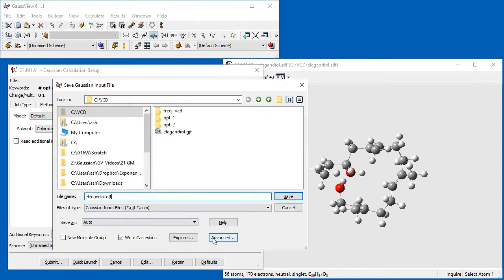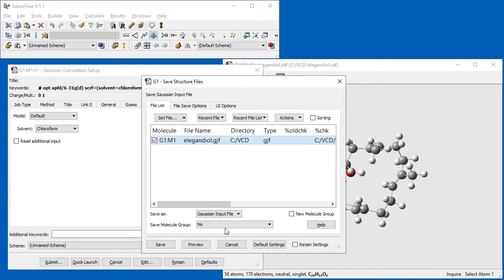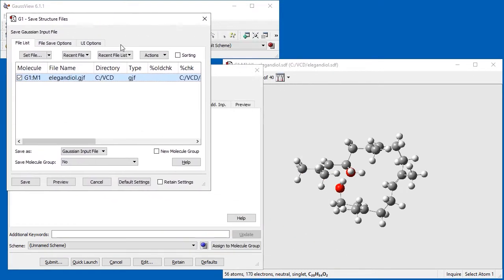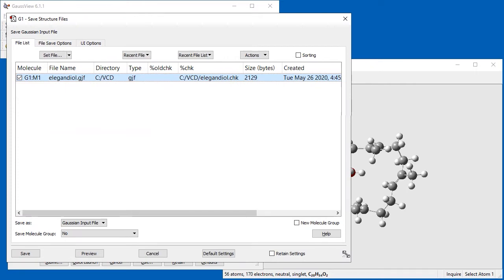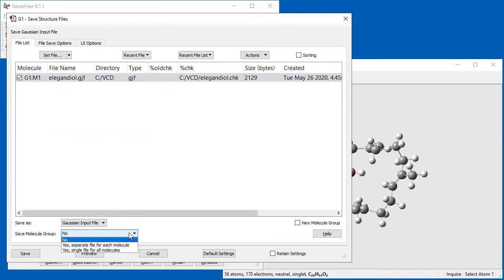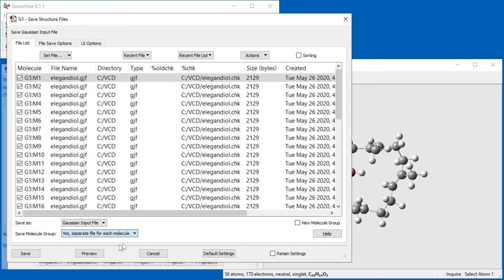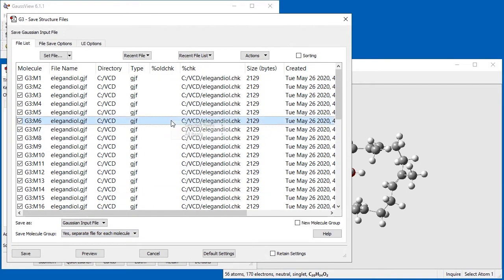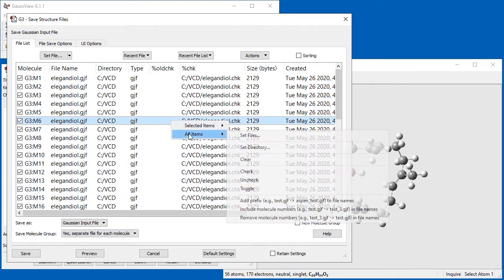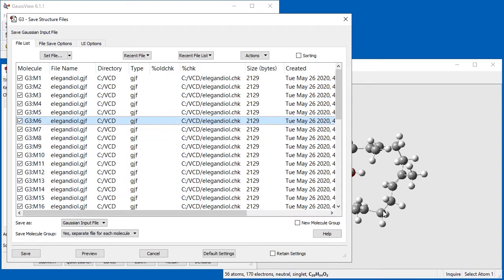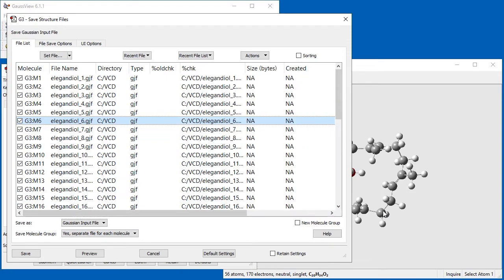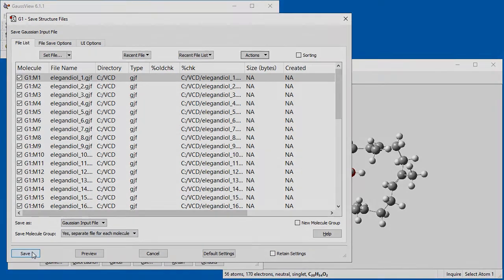Clicking the Submit button allows us to save the job files. In the Save dialog, we click Advanced, and the Advanced Save Structure Files dialog opens. We change the Save Molecule Group option from No to Yes separate file for each molecule in order to save each molecule into a separate job file. We right-click inside the list to open the context menu, and select Include Molecule Numbers in File Names from the All Items submenu. Each file now has a unique name. We click Save to save all of the job files and then go on to run all of the jobs in Gaussian.